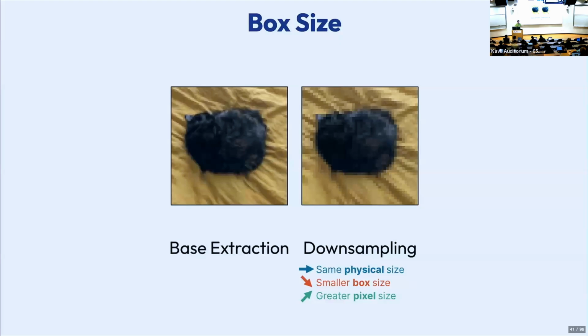There's something called the Nyquist limit, which says the finest resolution, the highest resolution that you can represent in an image is twice the pixel size. So if your pixel size to start with is 1 angstrom, your final 3D map will never, mathematically, have a resolution better than 2 angstroms. Okay? So if you downsample by 2, now your pixels represent 2 angstroms in physical space, which means your map will never have a resolution better than 4 angstroms. Okay? So the speed costs you something.